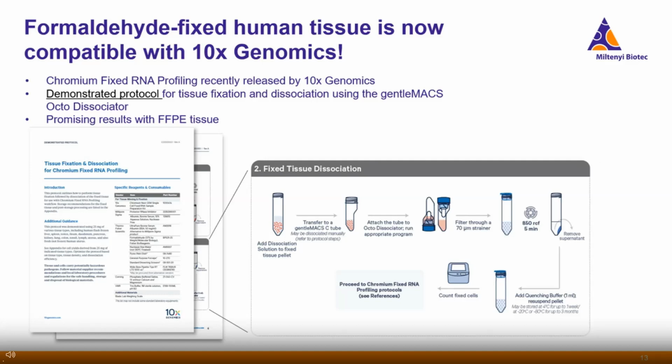Along with the kit, 10x released a demonstrated protocol for dissociating fixed tissue using the gentleMACS Octo Dissociator. They even reported promising results using this kit with FFPE tissue that was dissociated using Miltenyi's FFPE tissue dissociation kit.